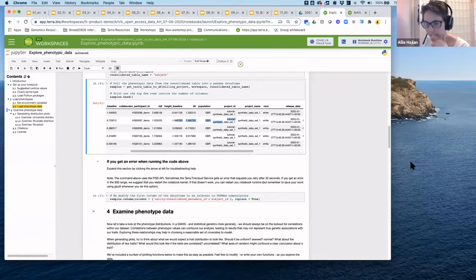Okay, so I'm going to address some of these out loud if I can. We have a question about box plots error. I get this error: KeyError, demographic annotated sex. I tried to solve it, but I could not.